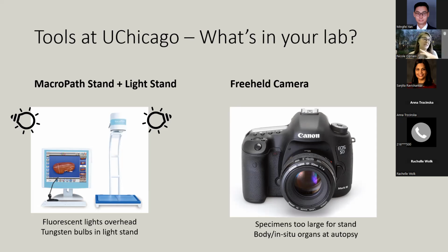So I completely understand the ease of just having it at your station and being like, click. But that active process of transporting it and laying it on this platter, to me, maybe makes you think more about framing the picture.